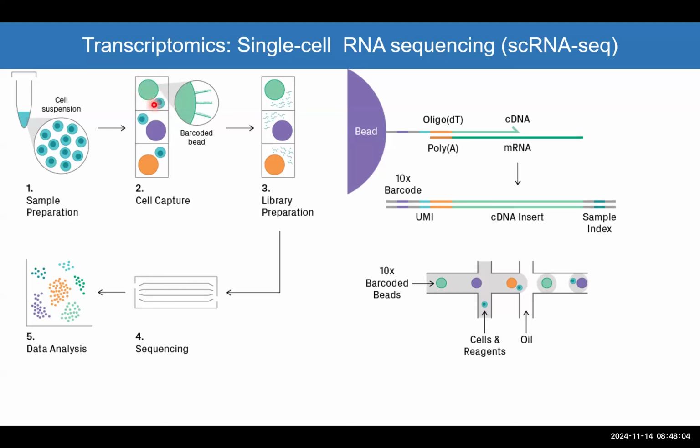And I would know the transcriptome based on that cell being with that bead. So there is a way to retrieve the information, and it's represented here for you. If you look at the surface of the bead, there are oligo-dT. Remember the oligo-dT primer for the reverse transcription. And there is this sequence here, which is called the 10x barcode.